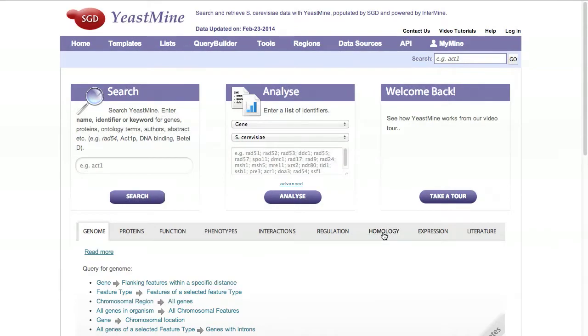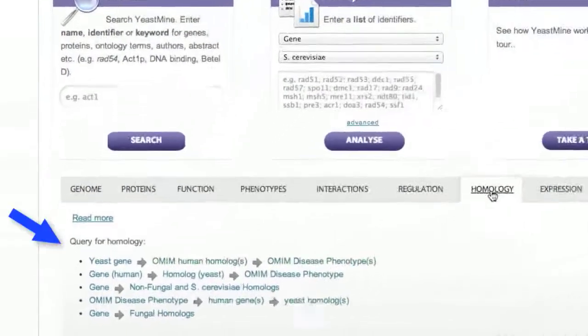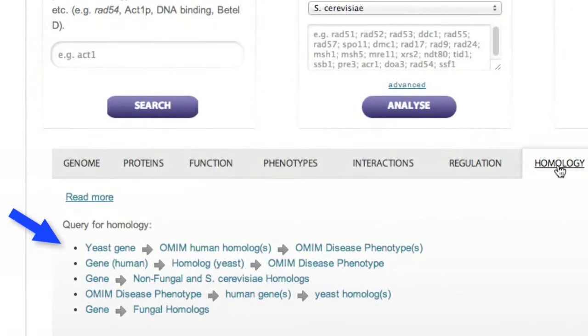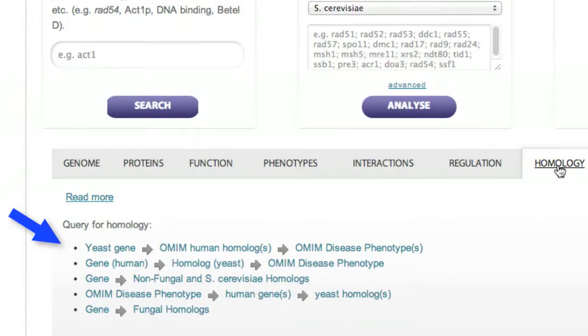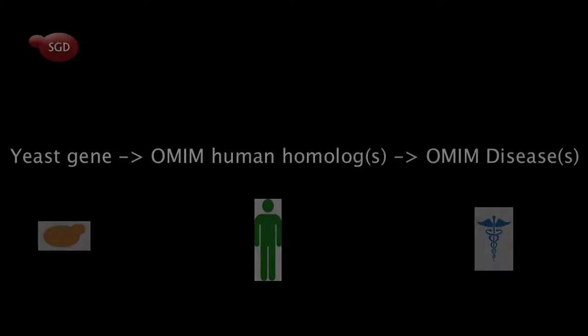From the YeastMine homepage, click on the new tab, Homology, to find four new predefined queries or templates that allow you to search for the newly added OMIM and fungal data.